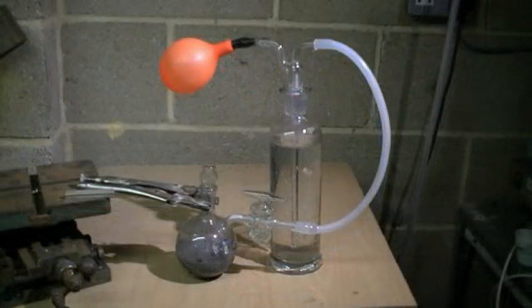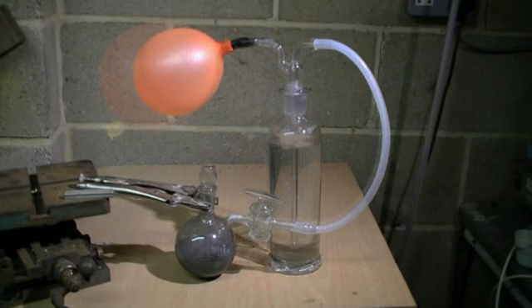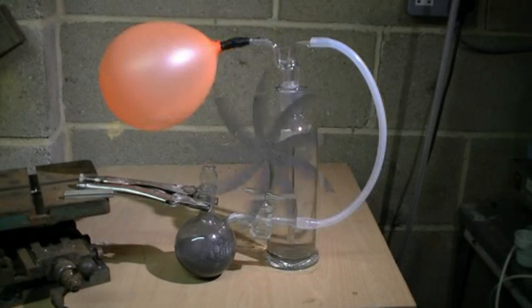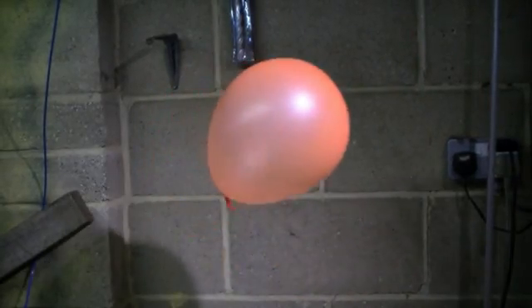If we attach a balloon to the end of our bubbler we can capture the hydrogen gas which is being produced. And of course hydrogen gas is less dense than air, so the balloon floats.